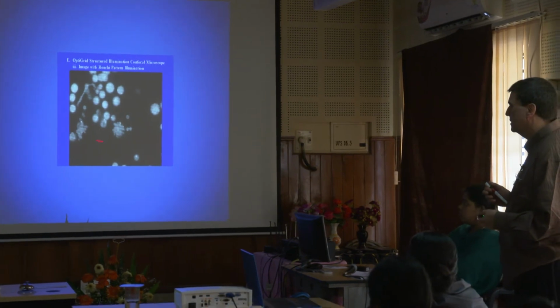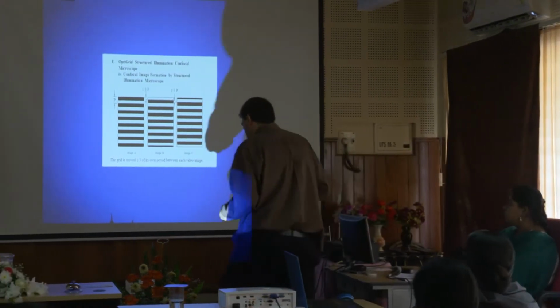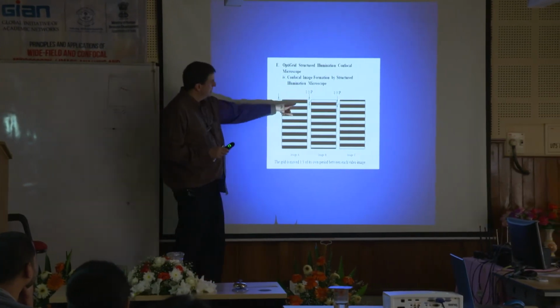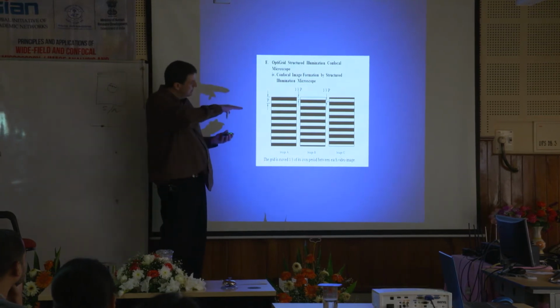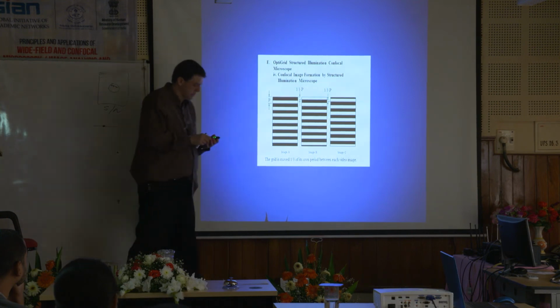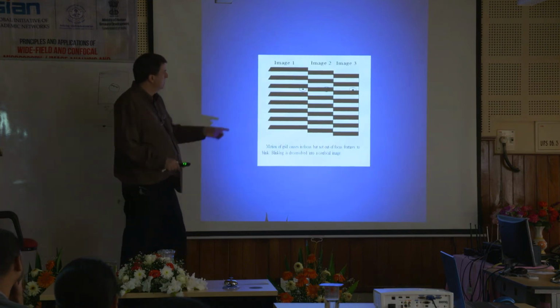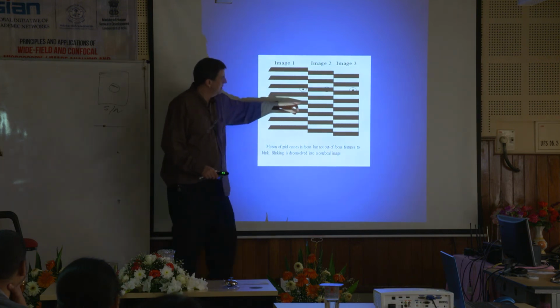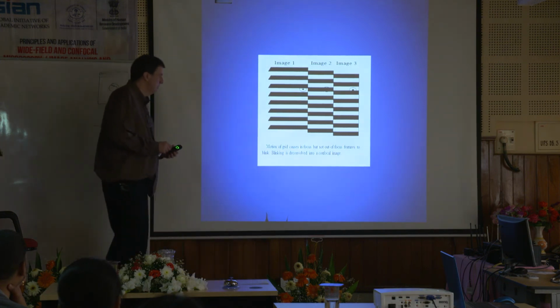But if you're able to move that grid a little bit each time in a precise manner, where this part has no light and this has the white, and you take three different pictures, a lot of physics here, then the first image will have the lines here, the second image will have them here, and the third will have them here. It'll collect this light where it's white.